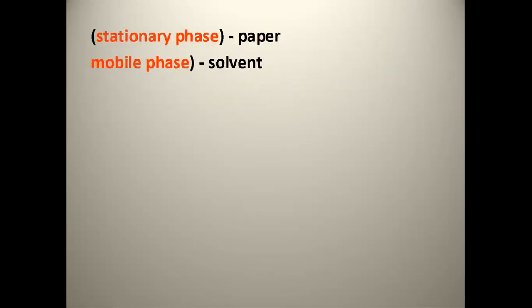Anyway, what we did in the experiment was use paper and a solvent. So in the experiment, we used 50% isopropyl and 50% water, but it's not actually so actually the alcohol mixture that you buy is already 70% alcohol, so it's not accurately 50%, so a little lower than that. But we used that to create the mixture for the solvent.